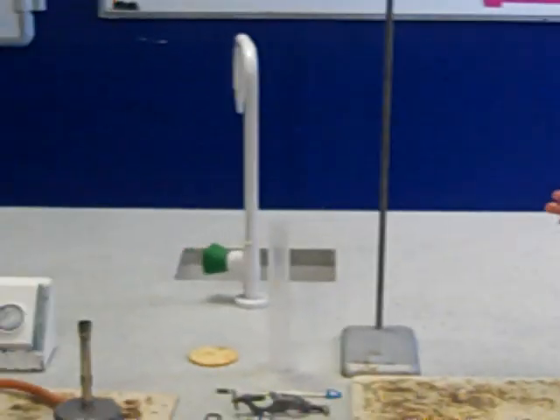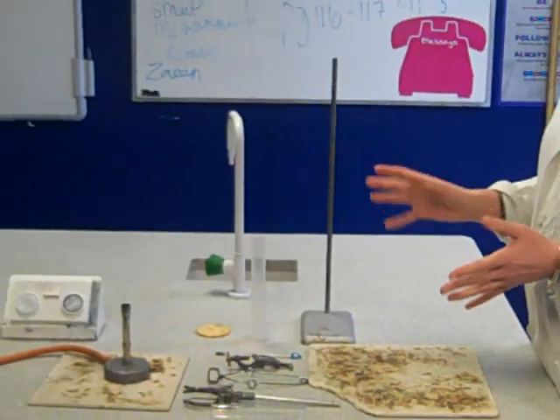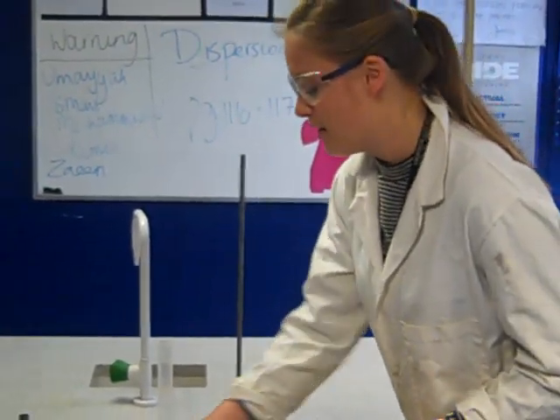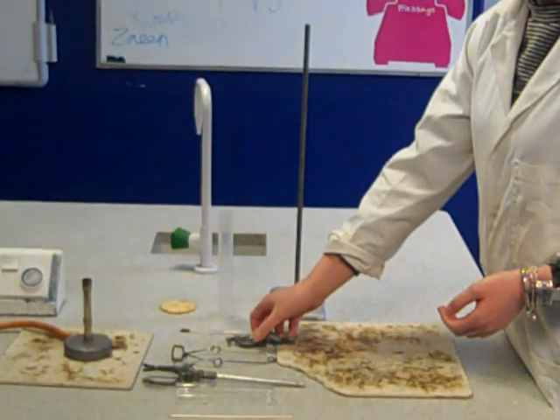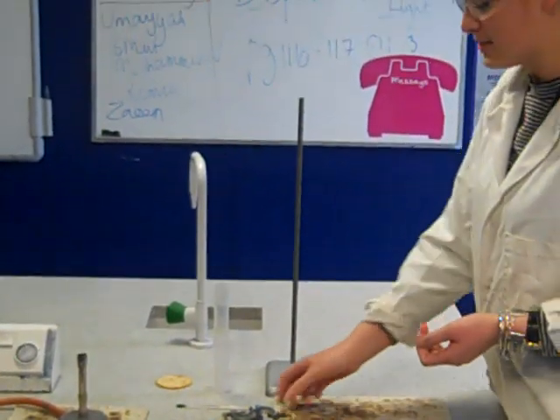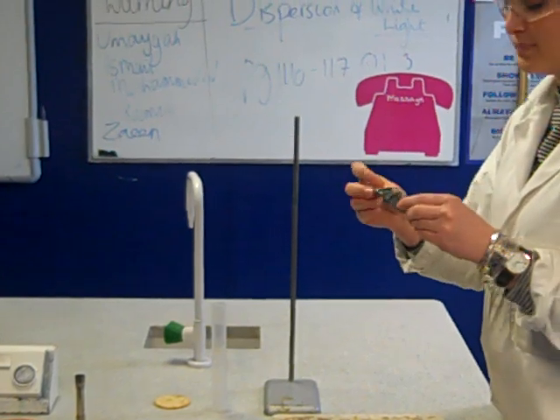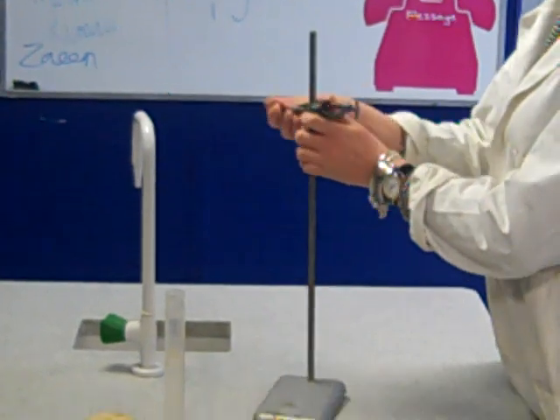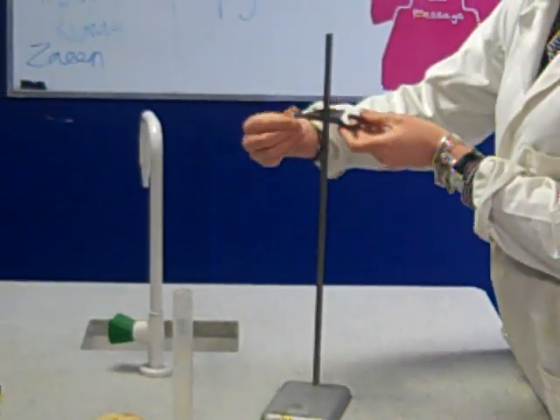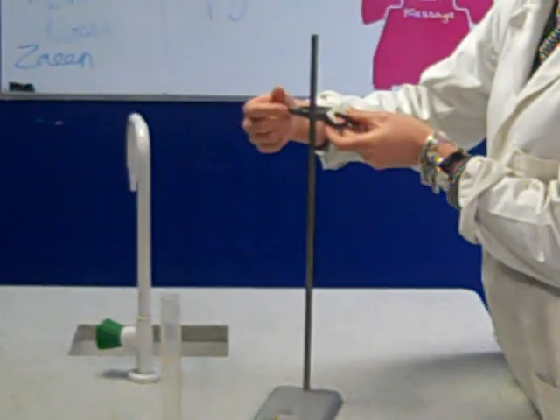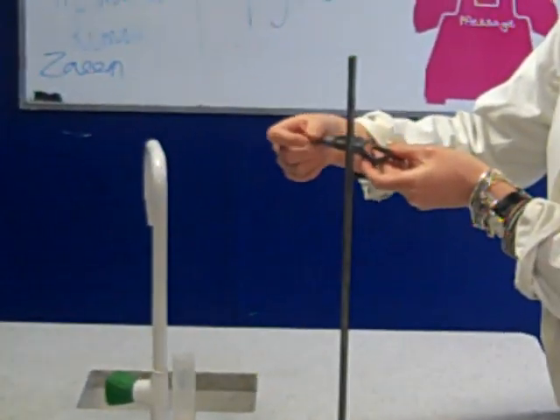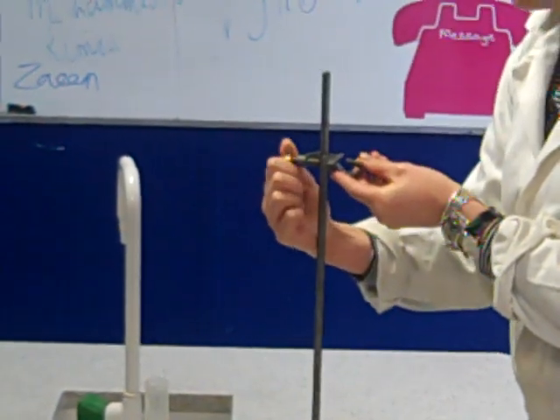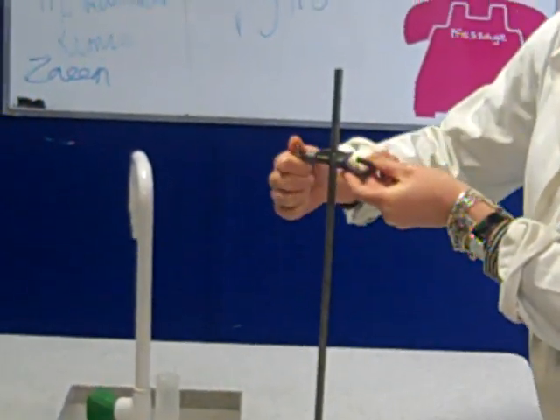Okay, so I'm going to pop those on. Right then, first of all, what I'm going to do, I need to set up my clamp stand with my boss and my clamp. So this is quite difficult to get right and some people often struggle with how we set these up. So what I'm going to do first, you take your boss and we need to undo the screws enough so that it can fit over our stand. So screw it nice and tight so it's not going to move. It might take a little bit of time. Okay, make sure it's nice and tight on so our boiling tube isn't going to fall over.